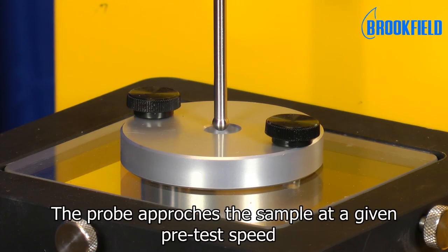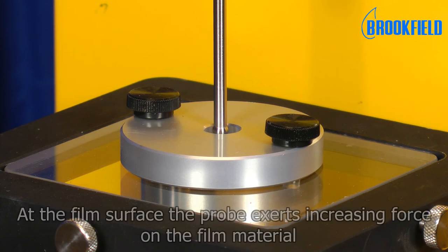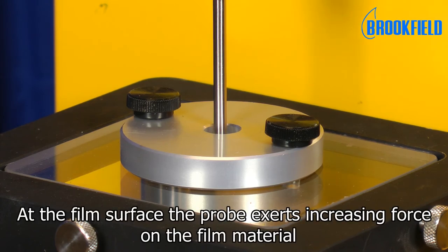Here the probe approaches the sample at a given pre-test speed. At the film surface, the probe exerts increasing force on the film material.